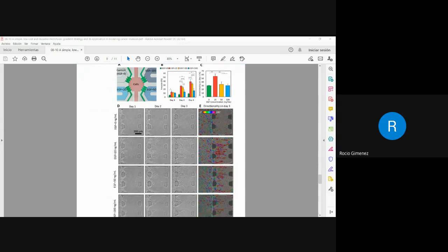So in conclusion, they developed a standalone microfluidic strategy combined with PDMS and polyethylene integrated microchannels that offers a pumpless, detachable, reusable microfluidic cell culture assay. And the device reliably supported cellular growth, proliferation, and migration of breast cancer cells. And they demonstrated that the microfluidic strategy enables differential invasion of cancer cells in response to generated chemical signals while supporting the cellular behavior and functionality.